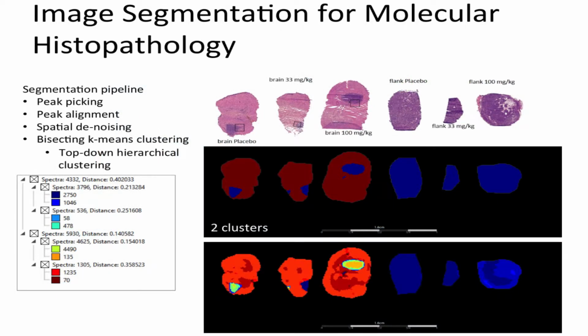So now some of the questions we have amongst ourselves and that we've received criticism for is how does the flank replicate the tumor that we are seeing into the brain? And here, if we do some segmentation and use 2 different clusters, basically at the molecular level, those tumors into the brain look very much like the flank tumors, which is, I think, a level of good news.